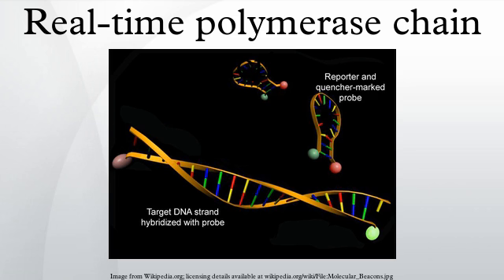Uses in research. In research settings, quantitative PCR is mainly used to provide quantitative measurements of gene transcription. The technology may be used in determining how the genetic expression of a particular gene changes over time, such as in the response of tissue and cell cultures to an administration of a pharmacological agent, progression of cell differentiation, or in response to changes in environmental conditions. It is also used for the determination of zygosity of transgenic animals used in research.